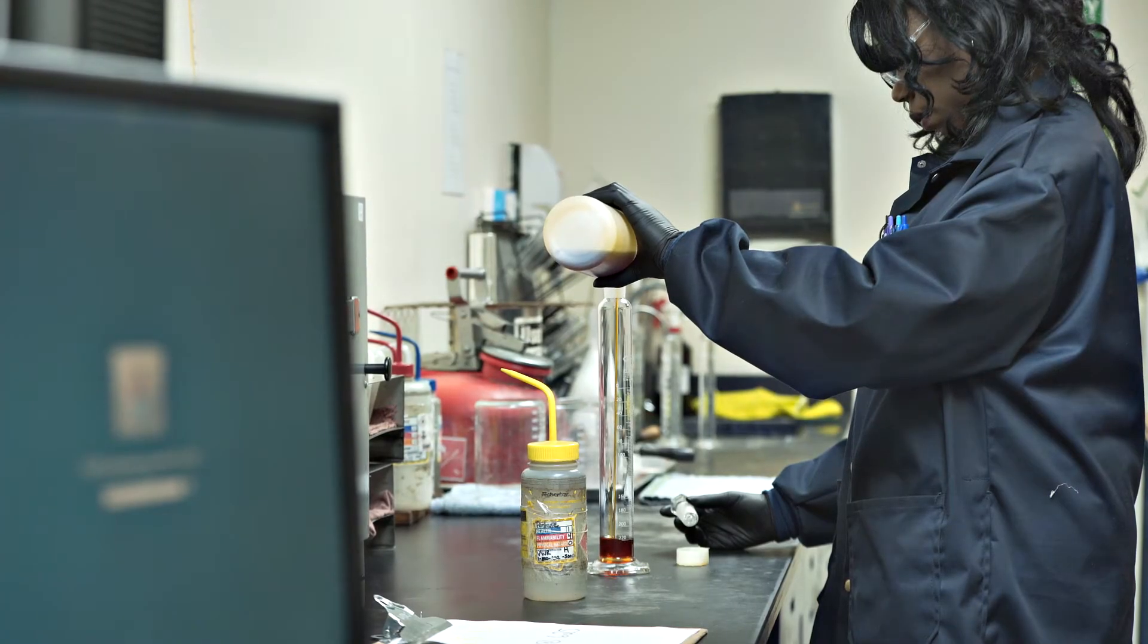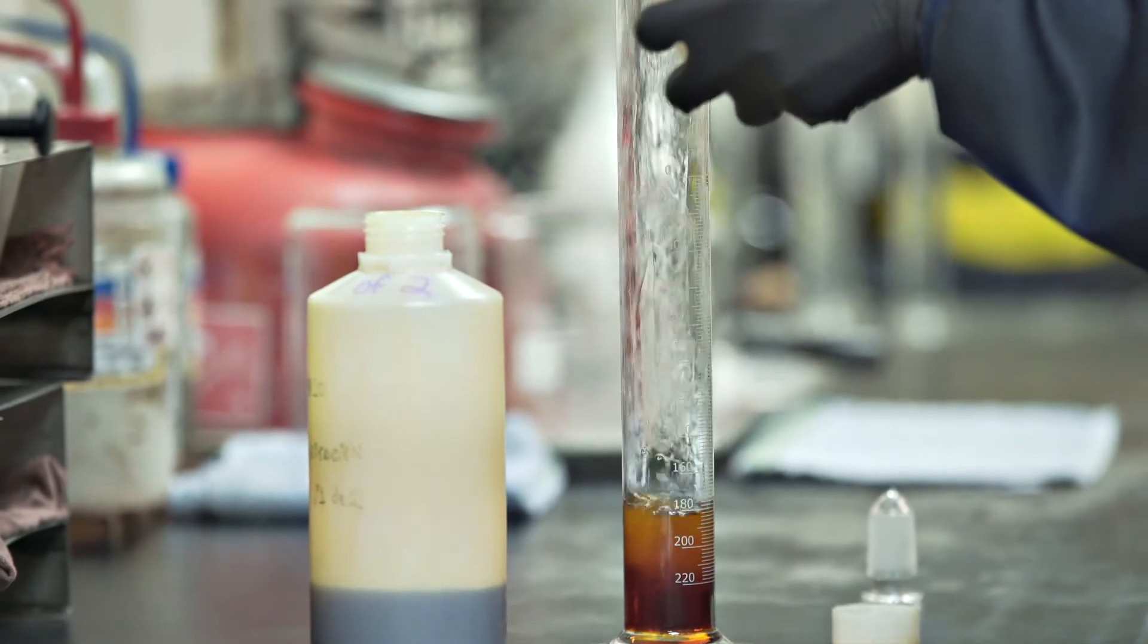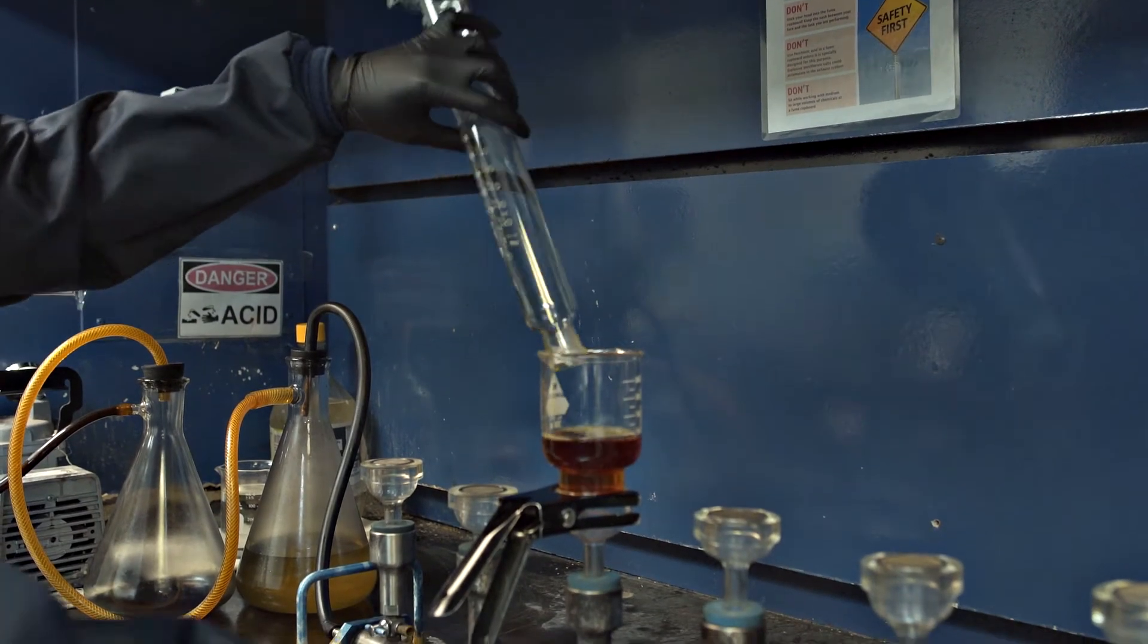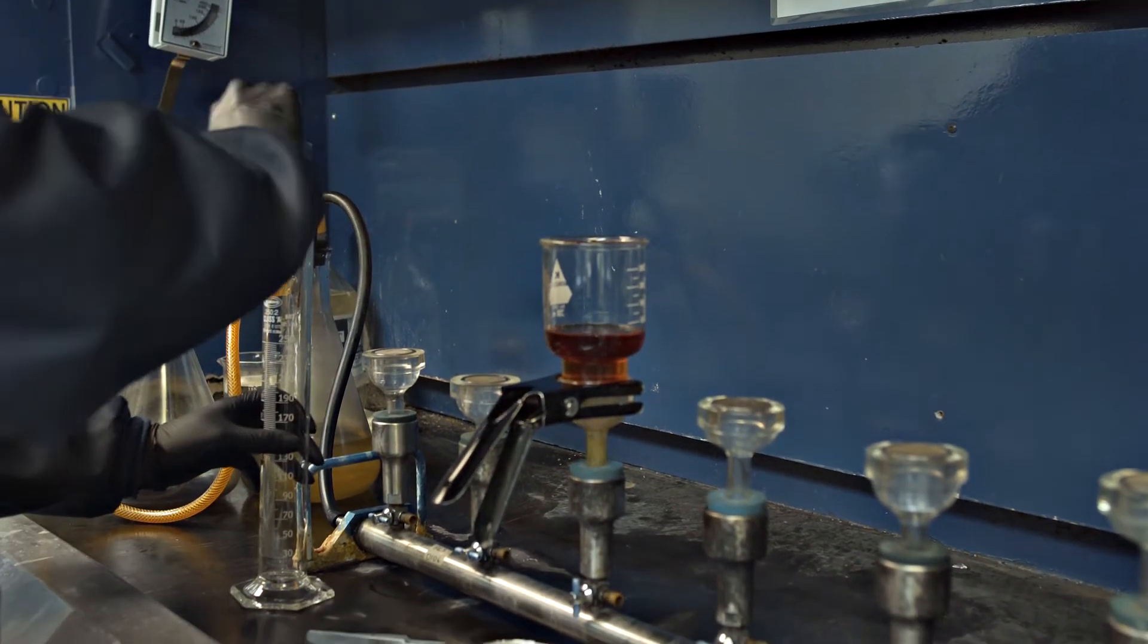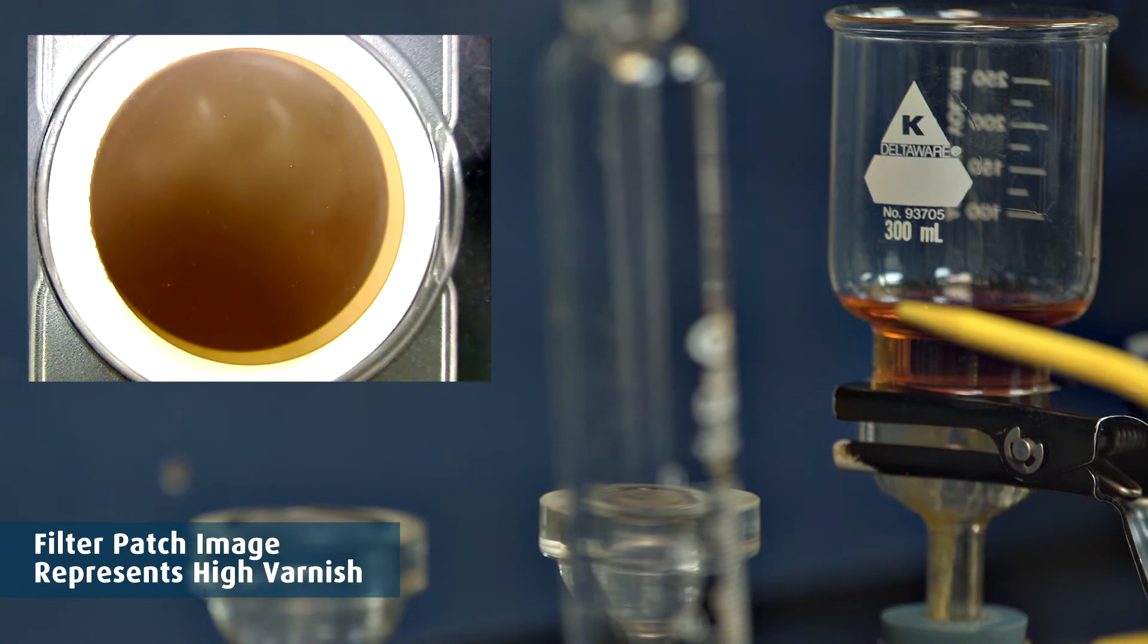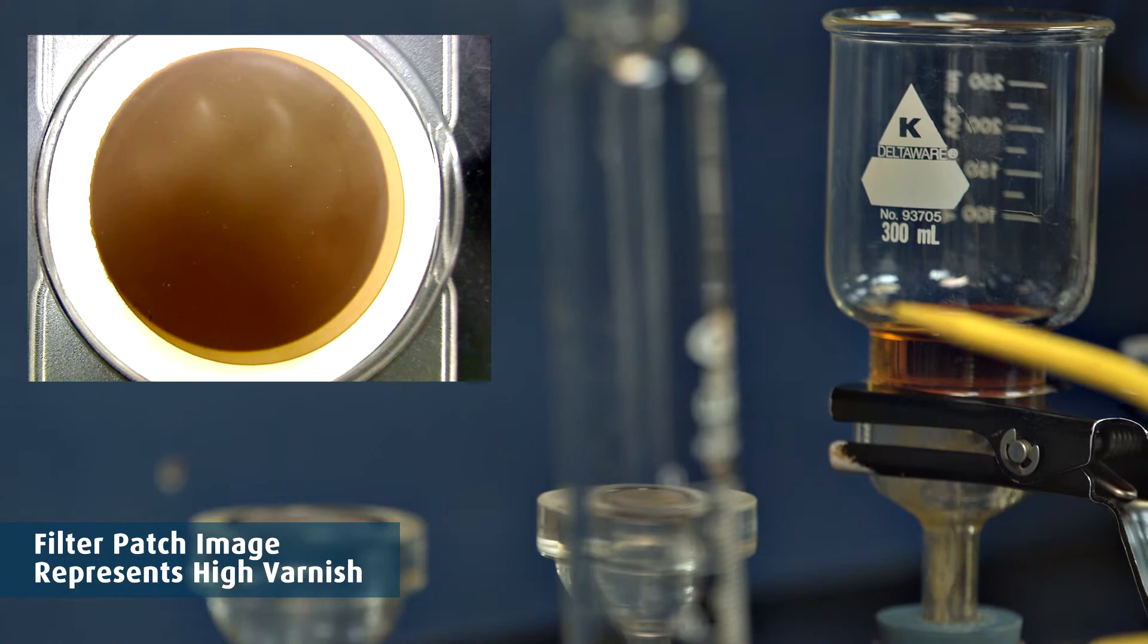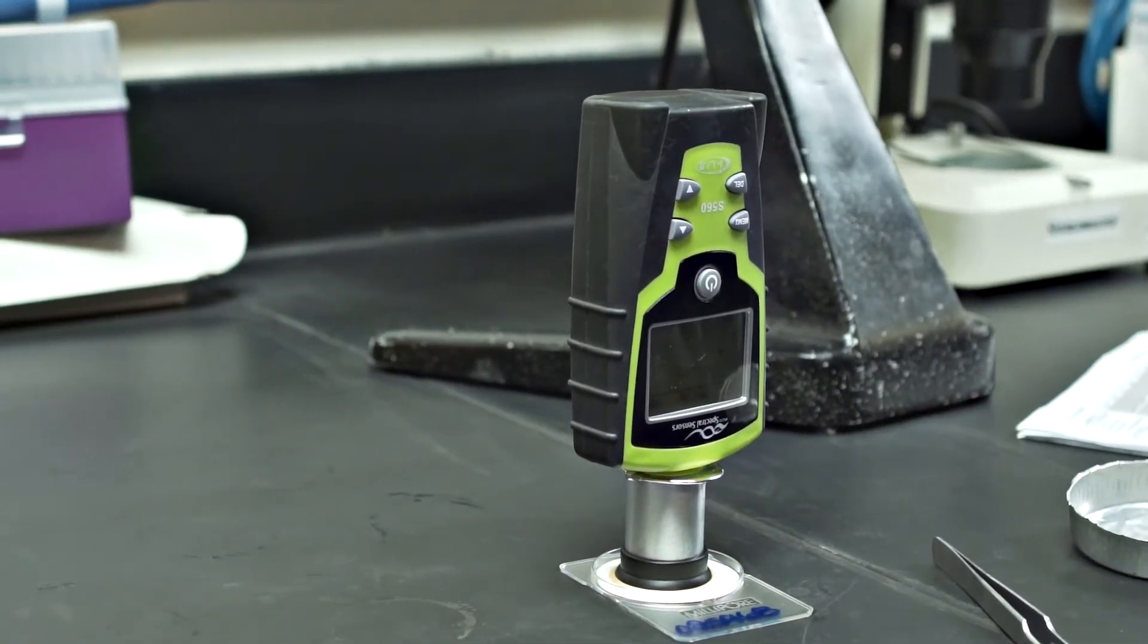MPC filter patch colorimetry is another valuable tool that looks at fluid degradation and provides an indication of insoluble varnish precursor compounds. Varnish potential package is a comprehensive test package that incorporates the MPC with additional specialized and standard test methods to deliver a matrix of test parameters that provides a comprehensive analysis of a fluid's tendency to deposit varnish on critical components.